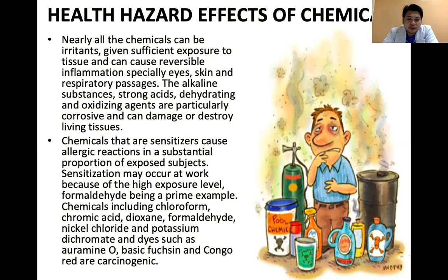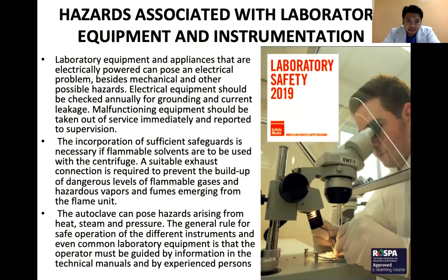Chemicals that are sensitizers cause allergic reactions in a substantial proportion of exposed subjects. There are also other chemicals class that are carcinogenic. So prolonged exposure to these chemicals can cause cancer. For example, basic fuchsin and Congo red. Those are stains sa histopath.